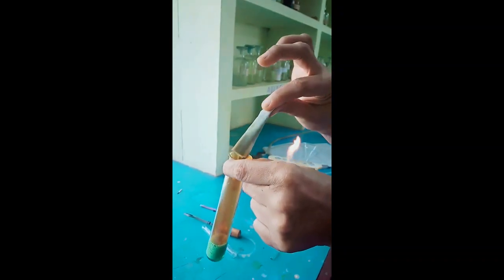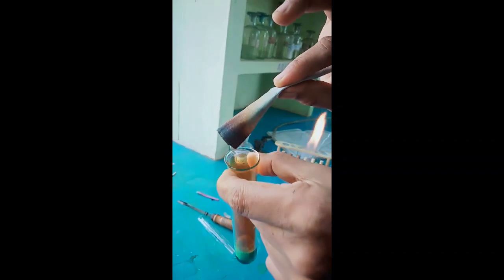The test for nitrogen dioxide is that a paper dipped in potassium iodide solution turns brown. So this is the test for nitrogen dioxide. A paper dipped in potassium iodide turns brown, and the gas evolved is reddish brown in color. So the reddish brown gas is nitrogen dioxide, which is acidic in nature.